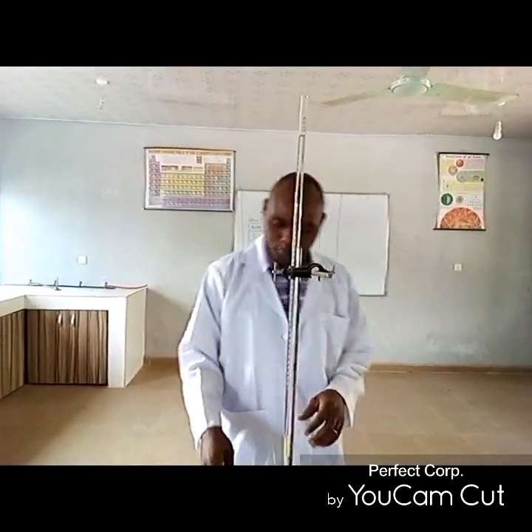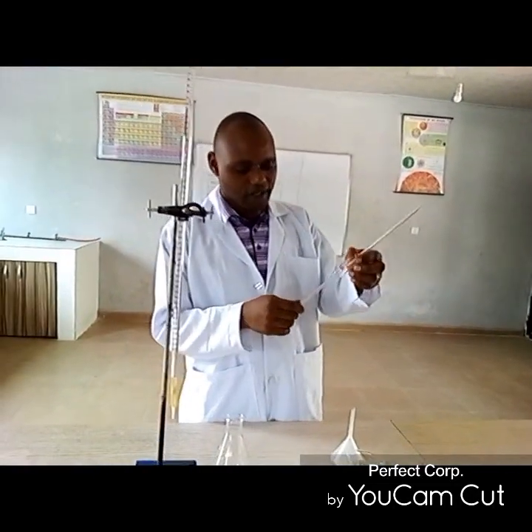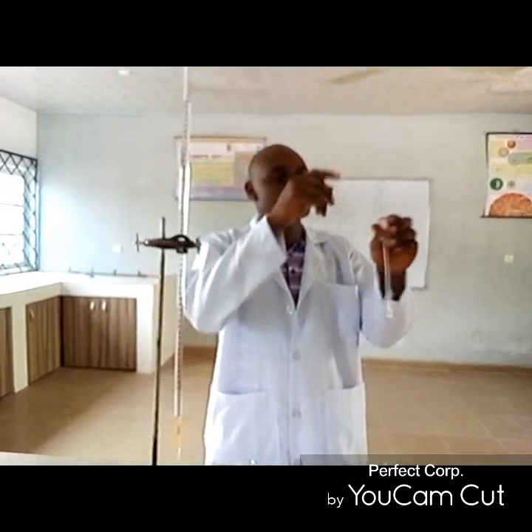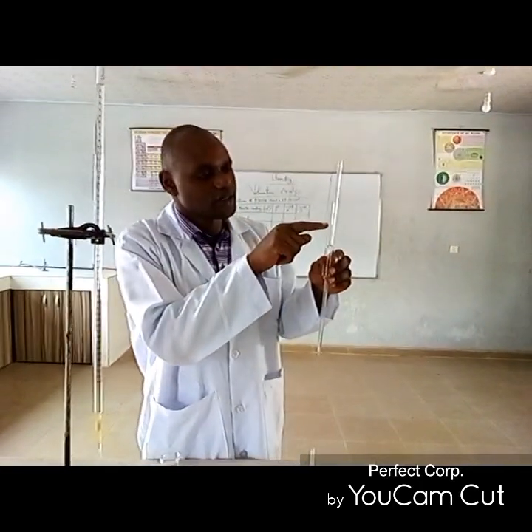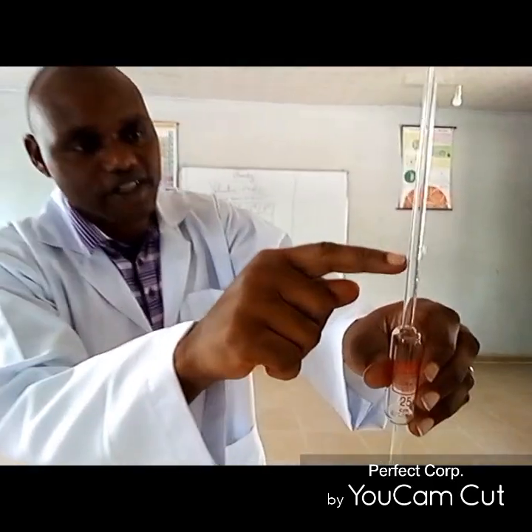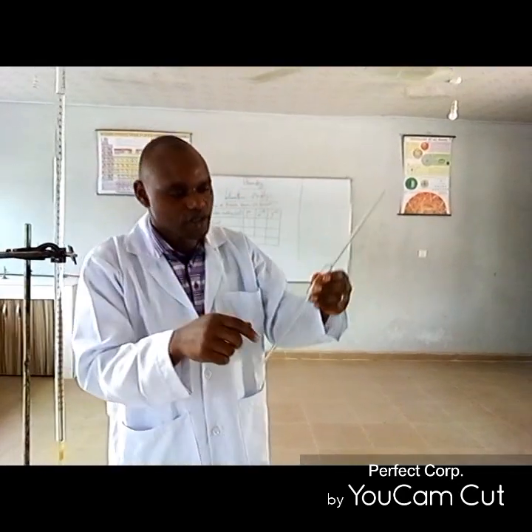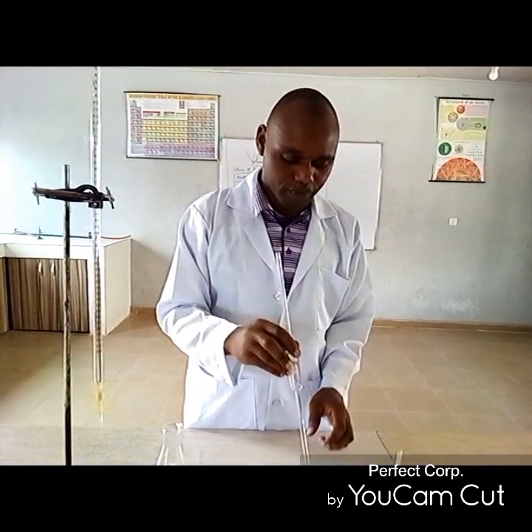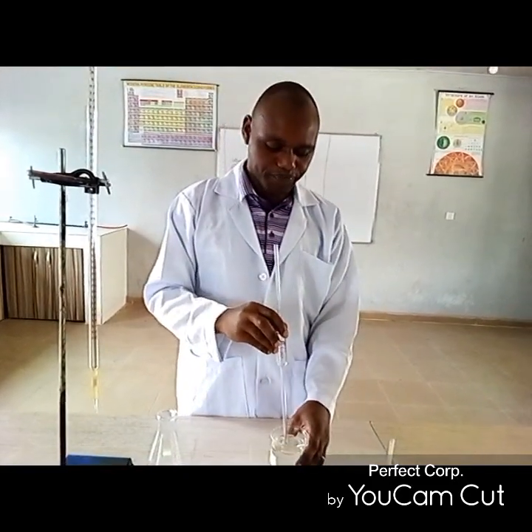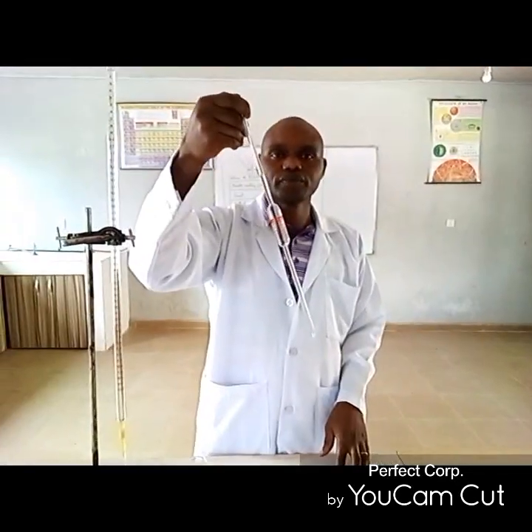Now we want to sip the base. When you are sipping the base, if you check the pipette, it has a meniscus level. If you take note, you can see something like a mark here. Are we seeing it? Yes, that is going to be the meniscus level for the base. Now let's see how we are going to sip the base. Now this is the meniscus level.